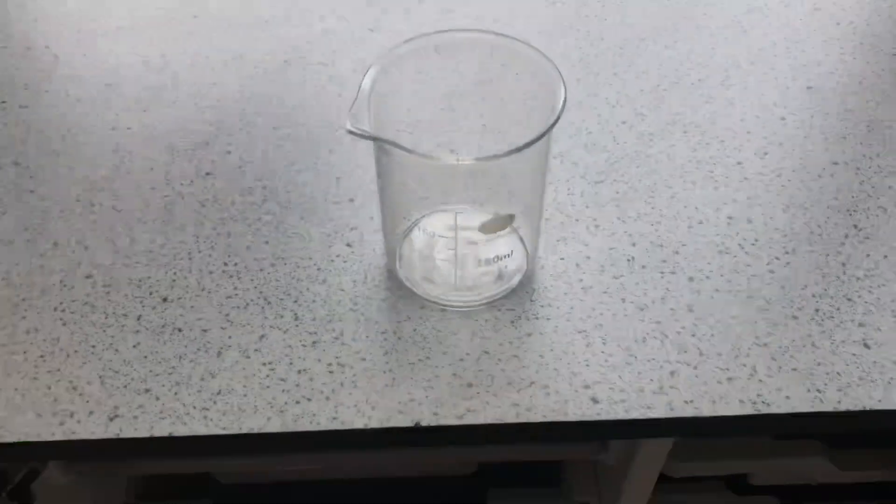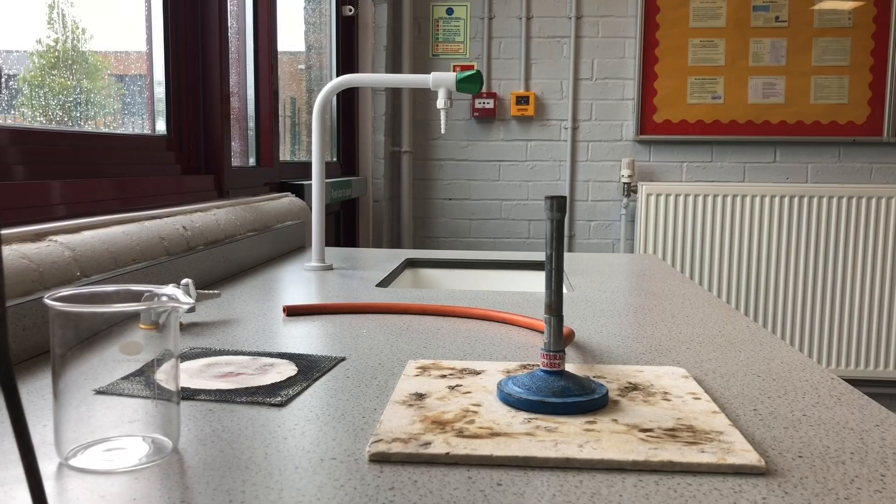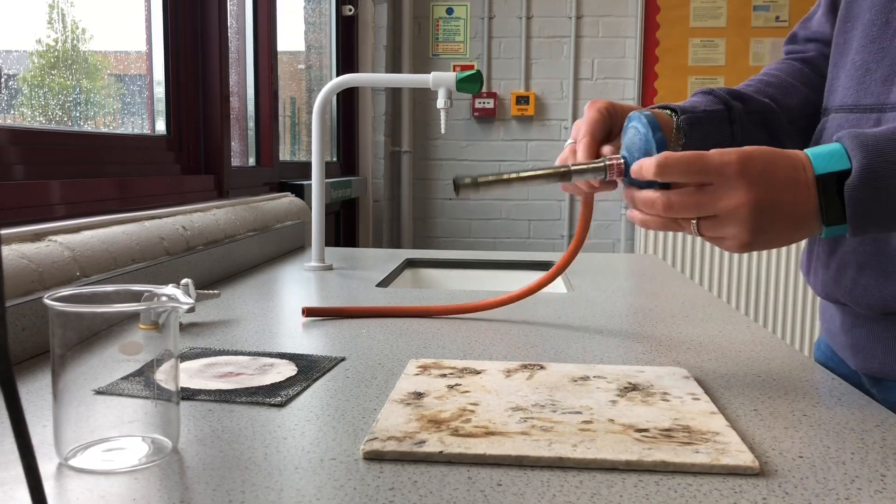So sometimes we get stuff out of our cupboards, sometimes we go to the general lab equipment. Now I'm going to show you how to set up all of the equipment. The Bunsen burner comes like this — the rubber tubing always stays on, we don't take this off.